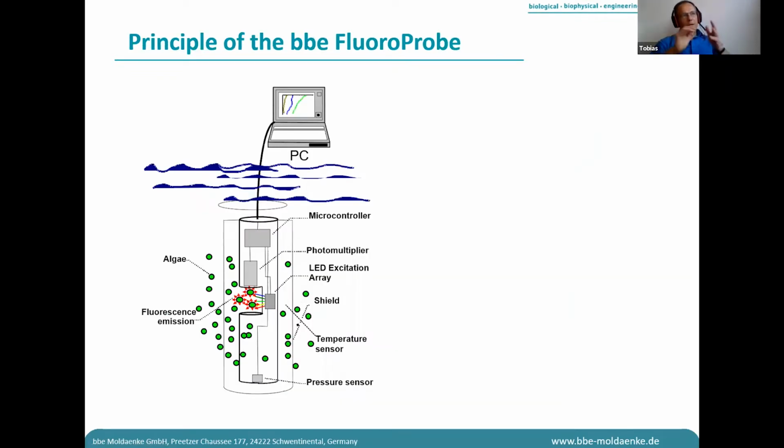The principle, now we come to the device we are using. The principle of the BBE FluoroProbe is that you have an LED array which excites the algae, and we have a photomultiplier which measures the fluorescence. And this fluorescence is in the water, then we have an LED array, and we have a shield that is a protection shield for the device.